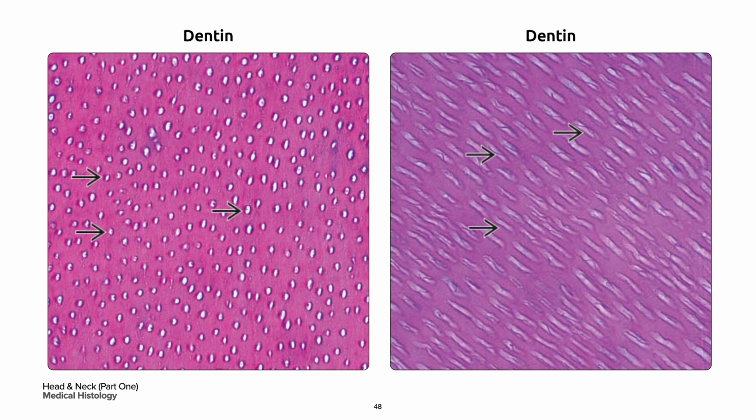On your left is a high-power cross-section of demineralized dentin showing the characteristic small tubules in single black arrow. On the right is the high-power longitudinal section of the dentin showing the slight curvature of the tubules in single black arrow. These tubules are filled with fluid and odontoblast processes. The tubules, however, make the dentin vulnerable to invasion of bacteria which may result in dental caries. Severe infection may result in the infection of the pulp in addition to tooth decay of your tooth structure.